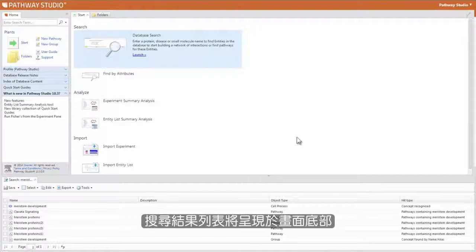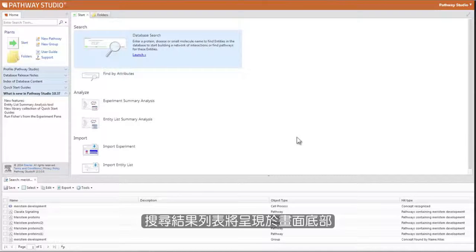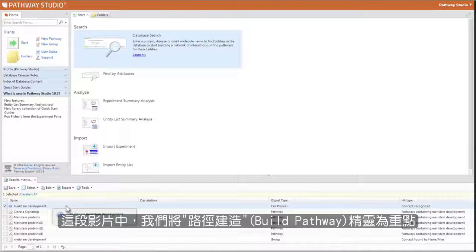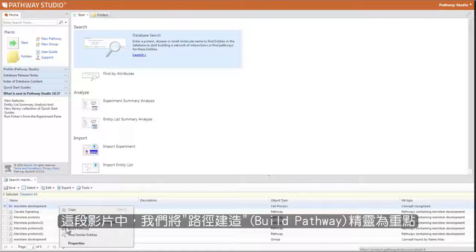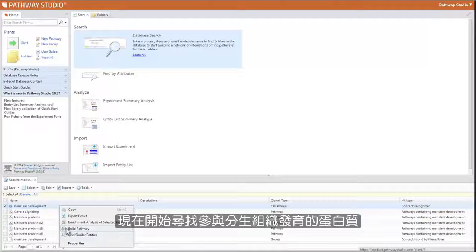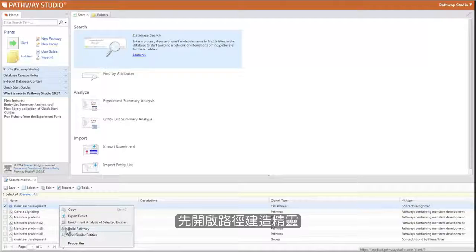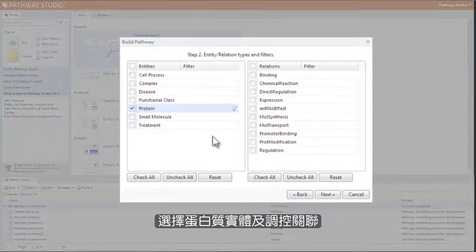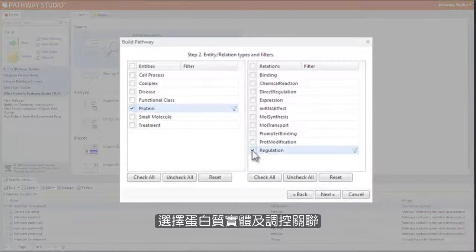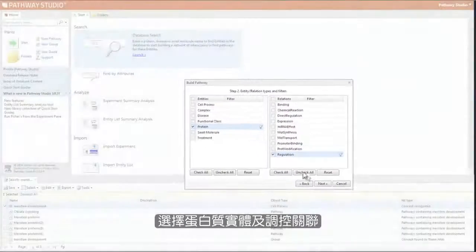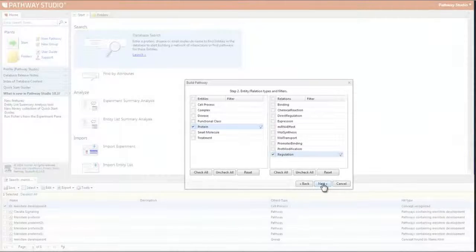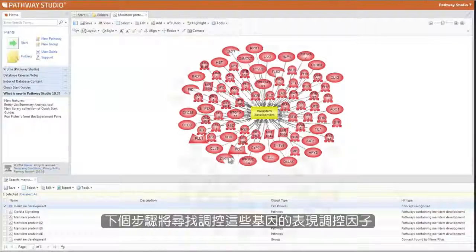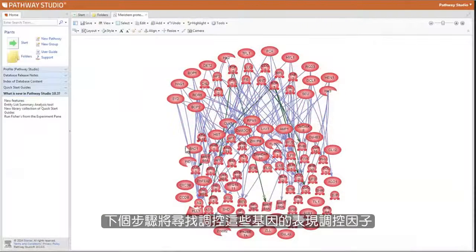A table of search results from the knowledge base appears in the bottom portion of your screen. In this video, we will focus on the Build Pathway wizard. To find proteins involved with meristem development, open the Build Pathway wizard and select proteins entities and regulation relationships. Now, in the next step, we find other proteins that regulate the expression of these genes.